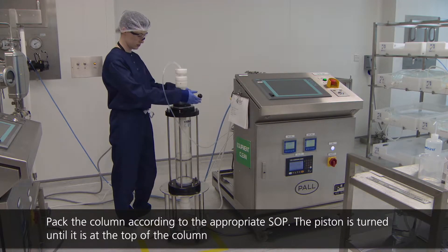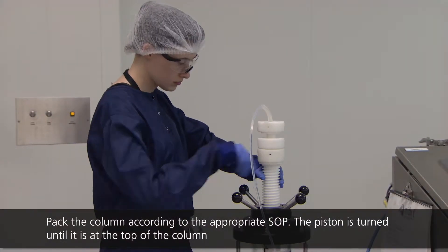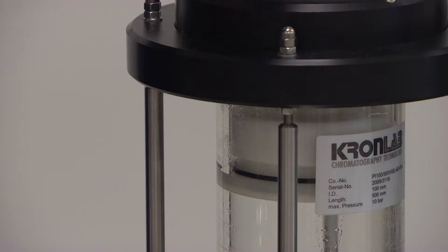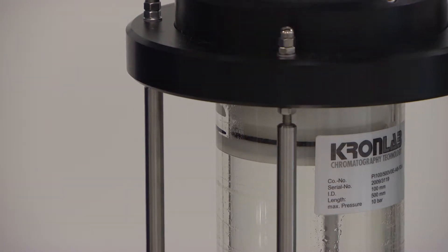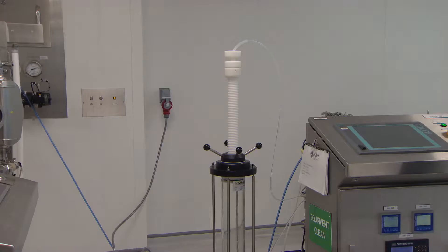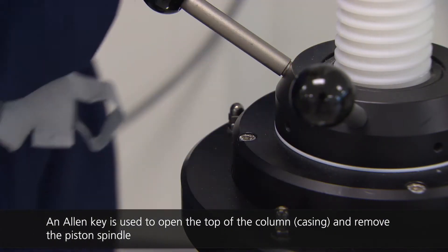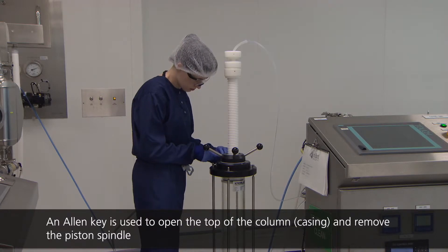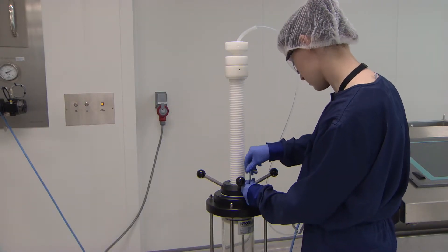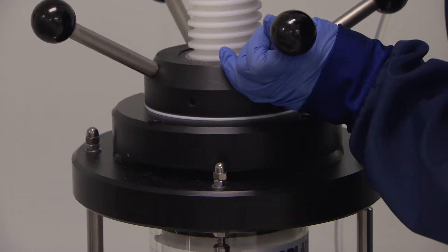In order to pack the column with resin, the column head must be removed. To do this, the operator uses an Allen key to loosen the bolts at the top of the column. With the column bolts removed, the piston is gently removed and placed on a trolley.